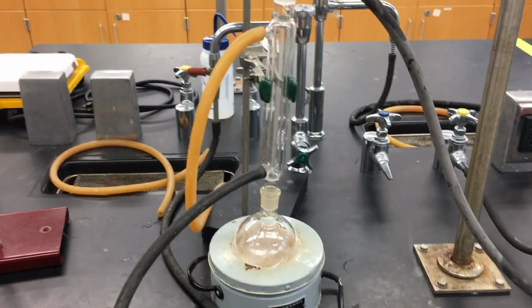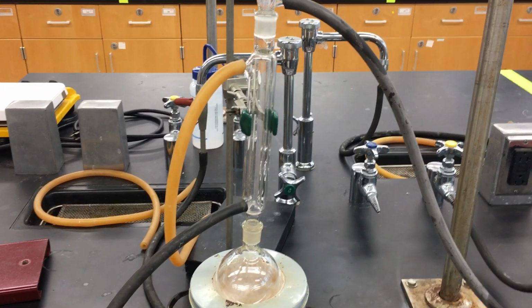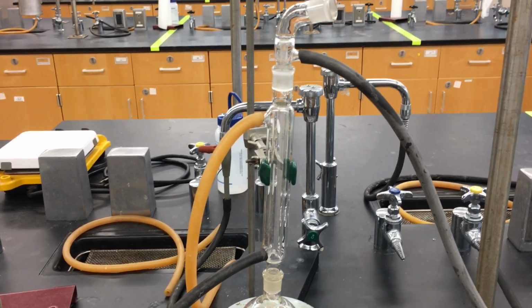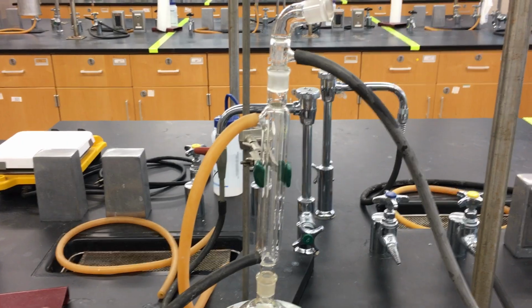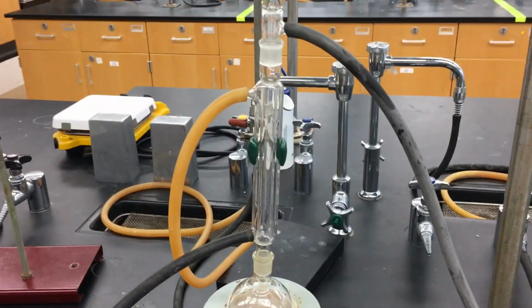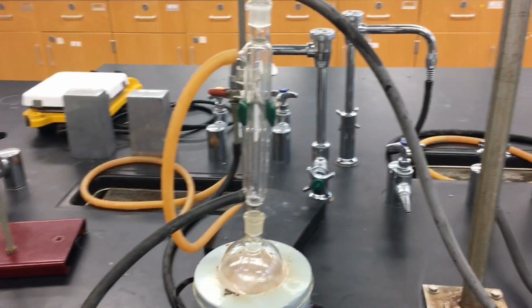Now let's have a look at the setup for this reaction, the SN2 synthesis of 1-bromobutane. In this synthesis, we are going to employ a new technique called refluxing.